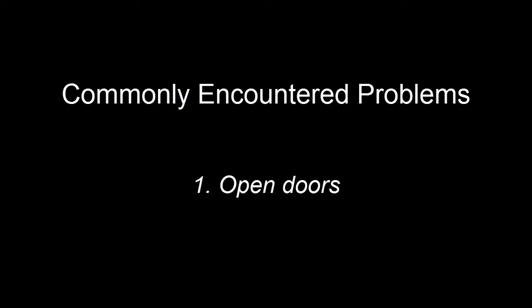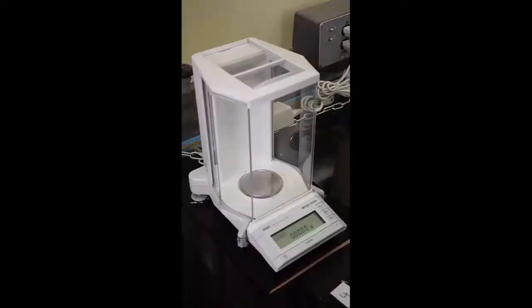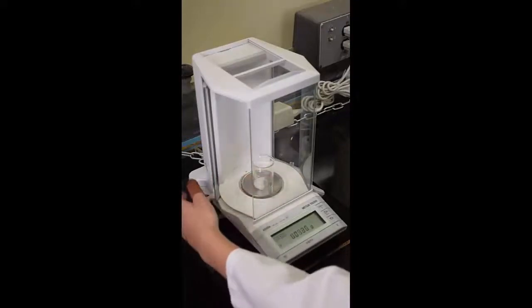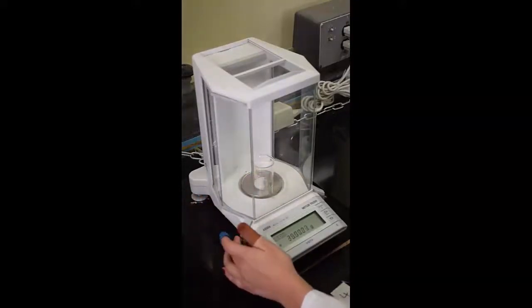1. Open Doors. Balance readings are very susceptible to drafts. Erratic readings are usually a result of an open door on the balance compartment.